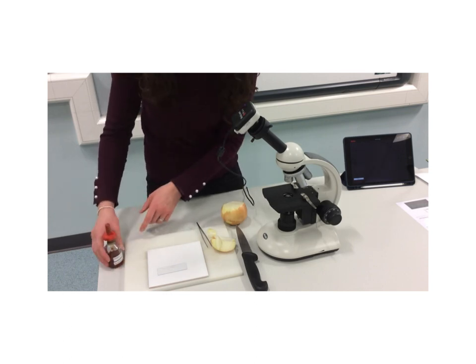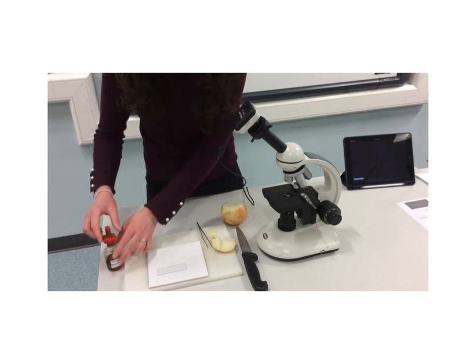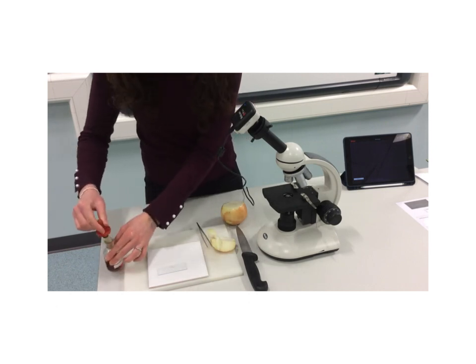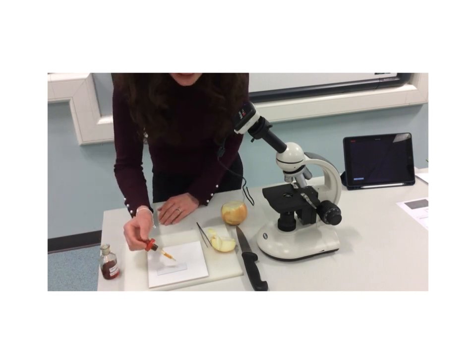So what we use is a solution called iodine. Hopefully you can see that in the video, and you need to know the name of that, and that will be filled in at the bottom of page 3. The stain that we use is called iodine solution. You can see it's an orangey colour, and all it does is simply stain the cells so that they're easier to see and the different parts are easier to see.